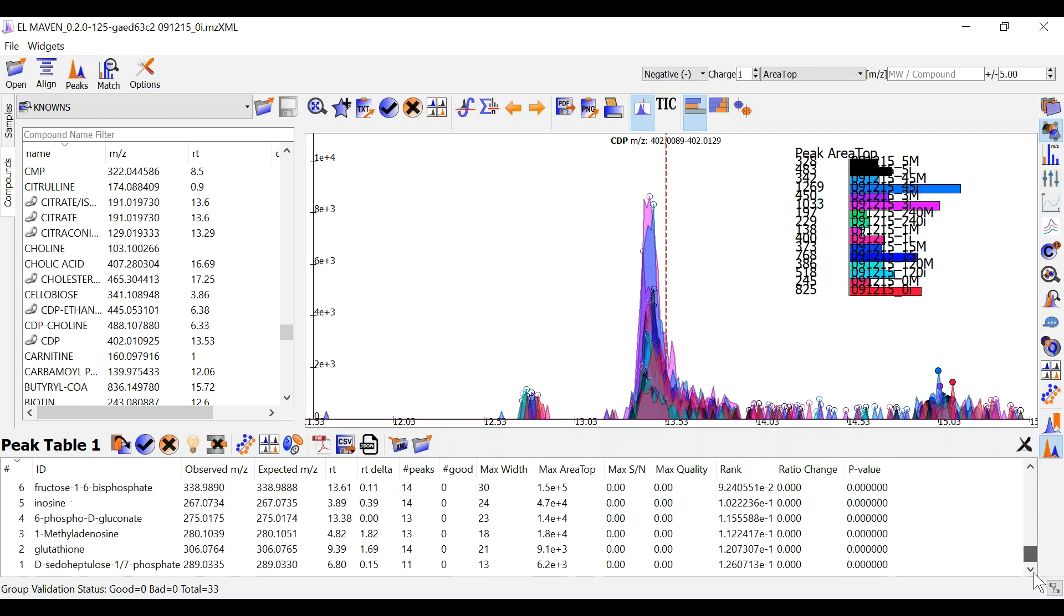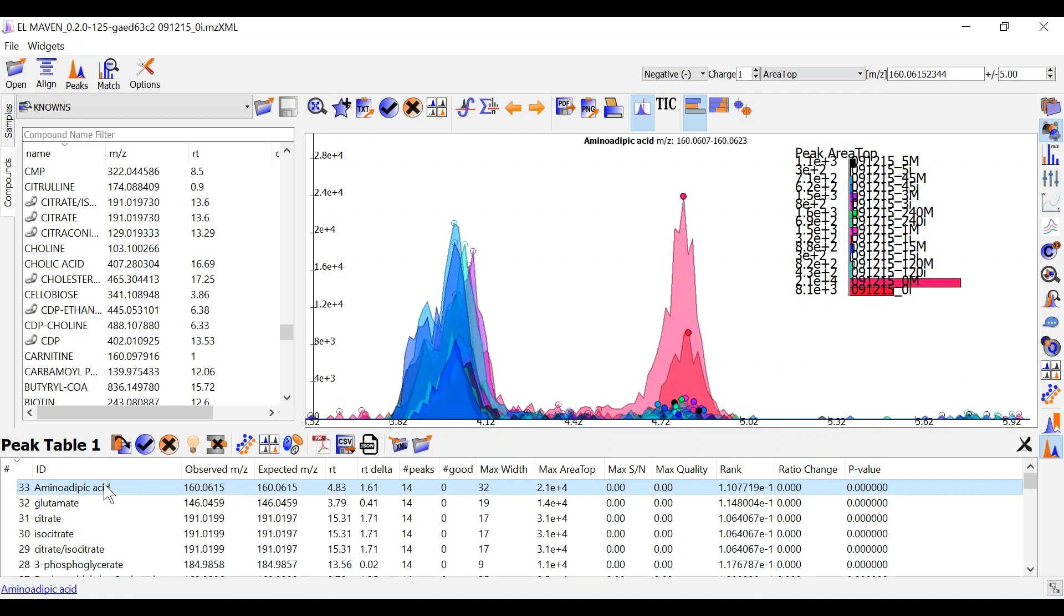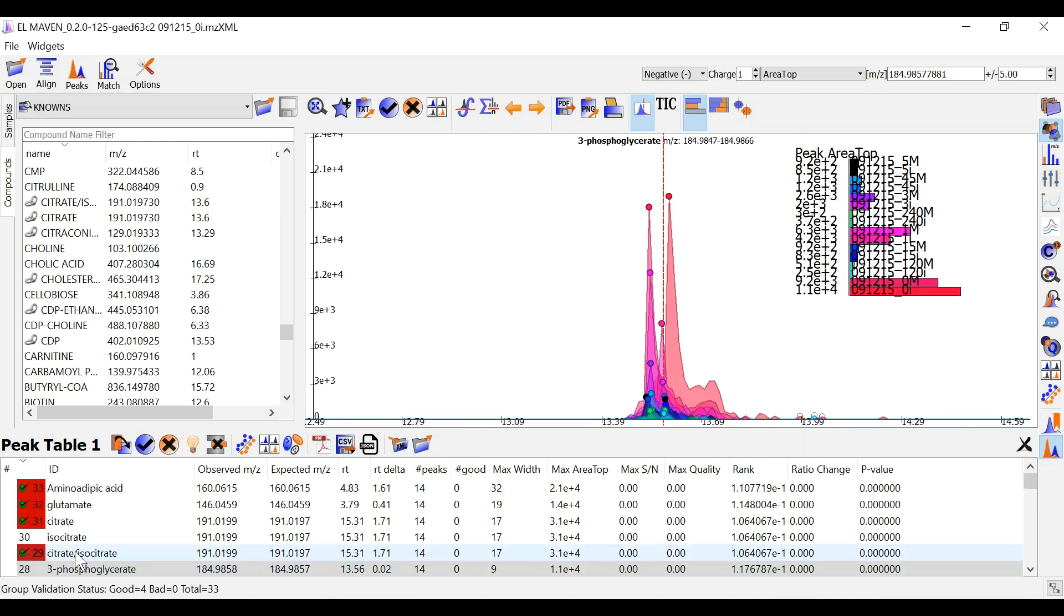ElmAven has detected for me around 33 metabolites. I can go over each one of them and mark them as good or bad.